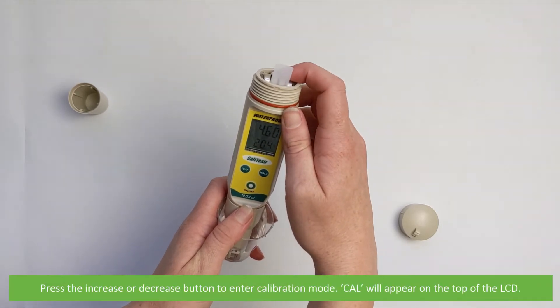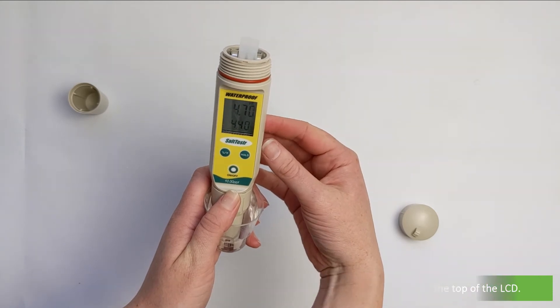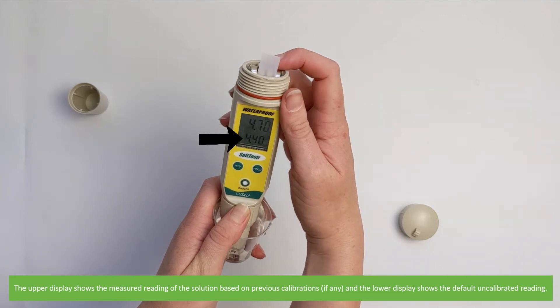Press the increase or decrease button to enter calibration mode. CAL will appear on the top of the LCD. The upper display shows the measured reading of the solution based on any previous calibrations, and the lower display shows the default uncalibrated reading.